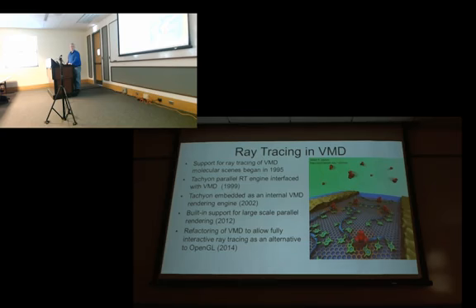No, for that you actually have to do the calculation, and then if you are thinking about preparing a structure for simulation, you actually have to assign the correct protonation state. You assign a patch to that residue, and you assign the correct protonation state. So you do it by deciding yourself.